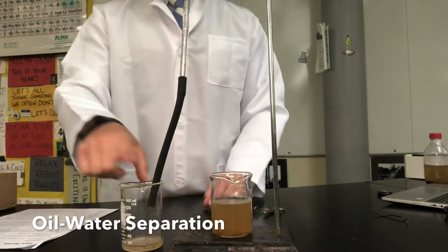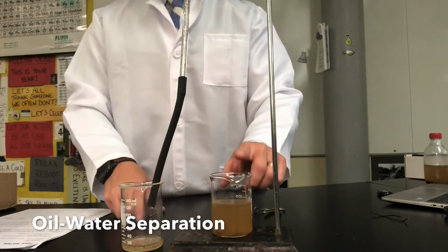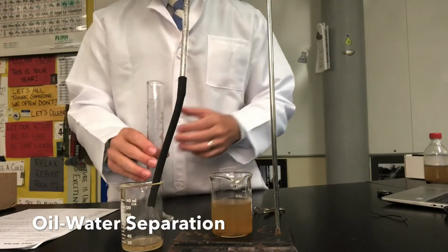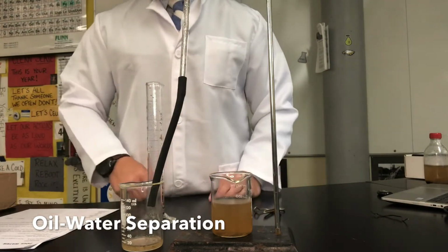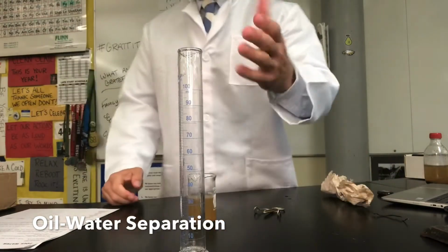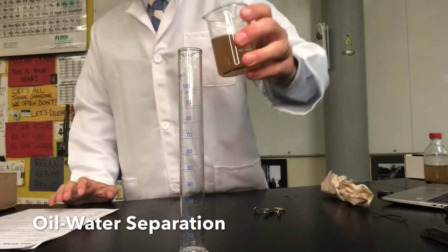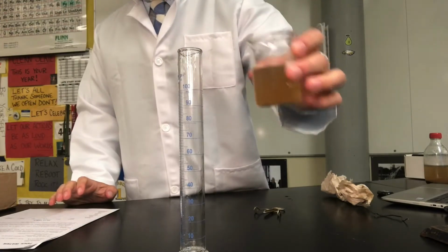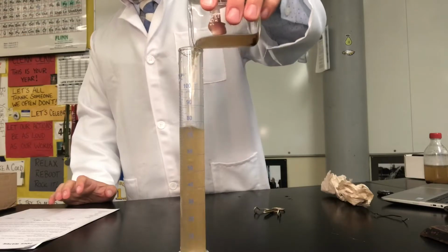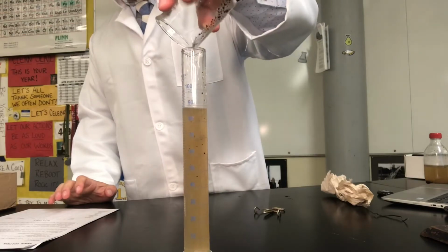All right, I'm gonna clean this part up and eventually distribute this slightly cleaner water back into a clean graduated cylinder so that we can take our next data point, which is on how much water is left. So stay tuned. All right, so we are back. We cleaned out our graduated cylinder, and now I'm taking the slightly cleaner water. We got rid of the oil, it looks like, but we're gonna see how much volume of that water is left.